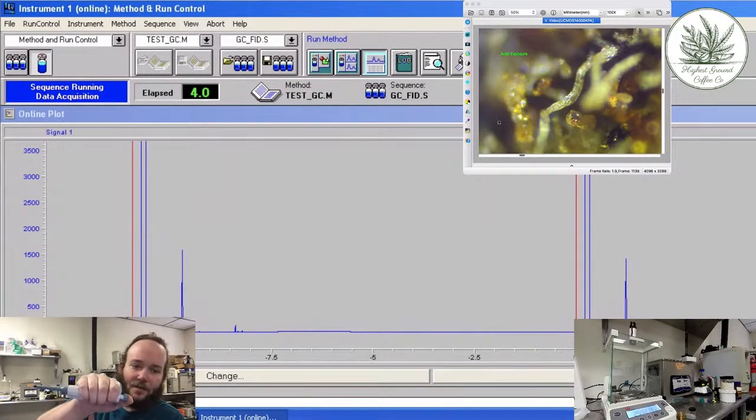This first level right here is what you use to get your measured amount. So you set this dial to whatever you want it to be, and then you hit the pump the first time, and that'll get that amount out. Now, this is based on displacement, right? So this is displacing air, and that basically sucks up a certain volume of liquid. The way these things are built, the low end is as least accurate as it can be, and the top end is the most accurate it can be.